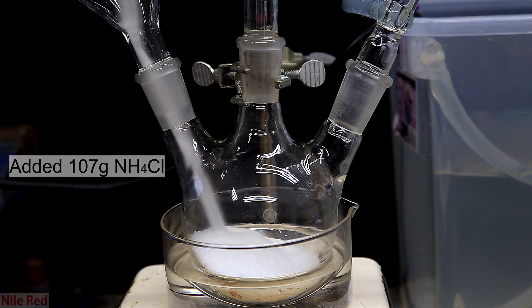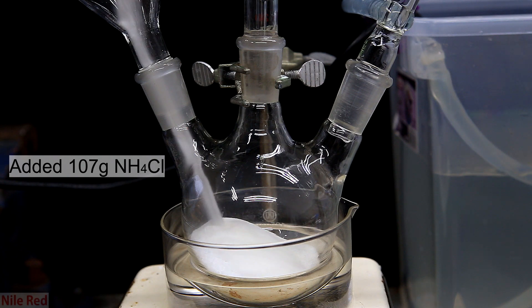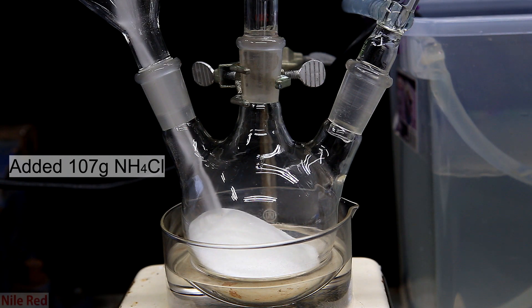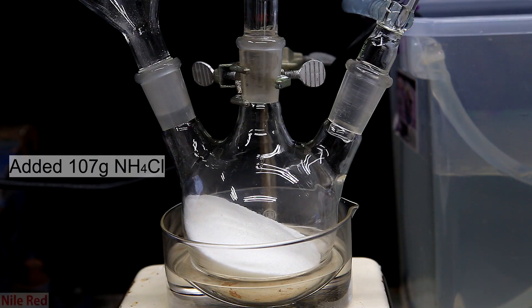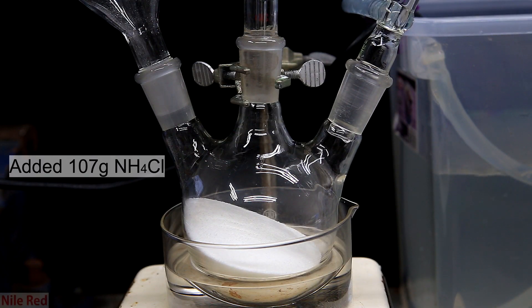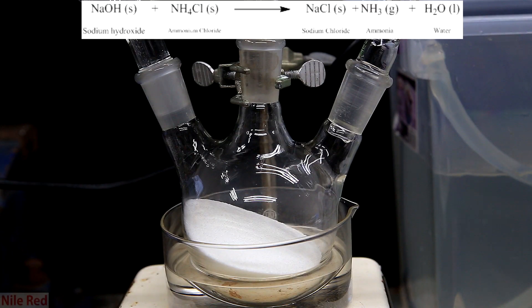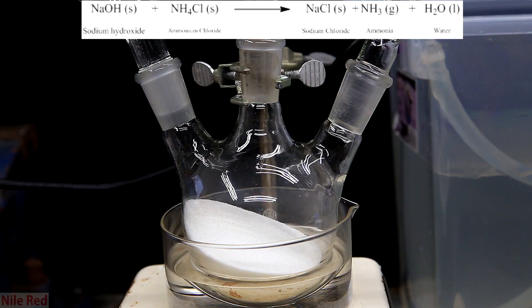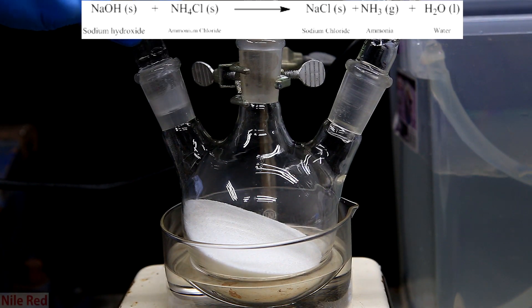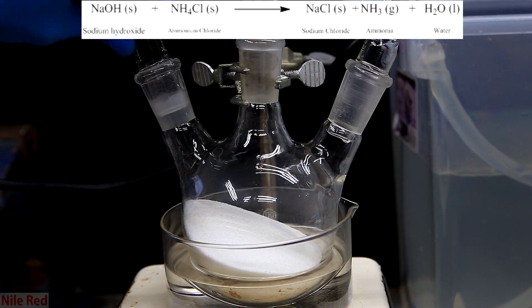Then on top of the sodium hydroxide, I added 107 grams of ammonium chloride. You can really use any ammonium-based salt, and I used ammonium chloride because I had it on hand. The reaction that we hope to be carrying out is shown above. The ammonium chloride should react with the sodium hydroxide to form sodium chloride, ammonia gas, and water.